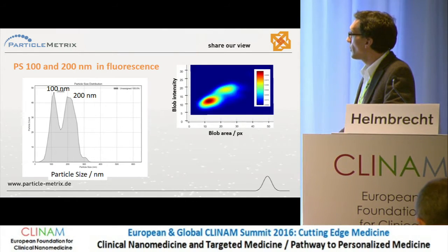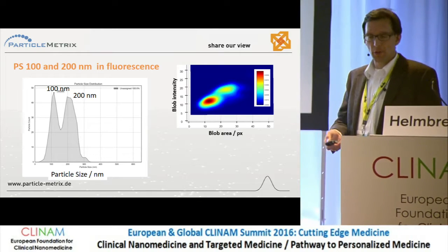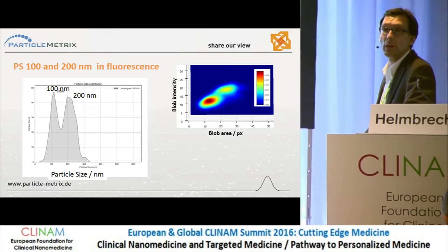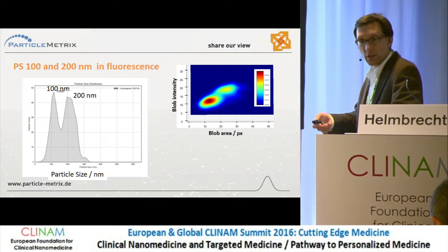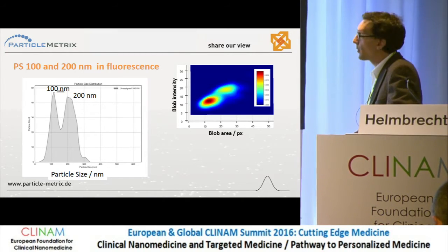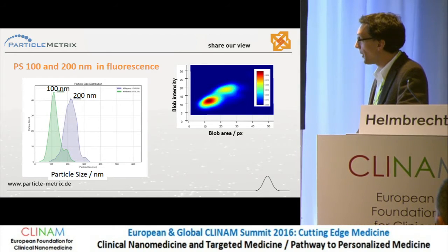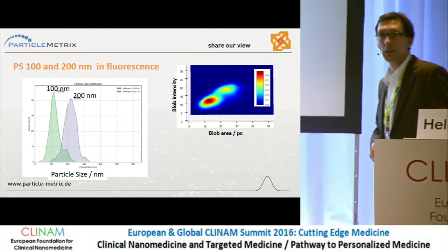In order to increase this, we can also make use of multidimensional and multivariate statistics, not only taking into account the step, the jump of the particles, so the diffusion behavior, but also the size, so how large is the object, and physical parameters of the object, so we can do multivariate statistics in order to separate. So this was quite straightforward, because it's two different sizes, so this is not so difficult to do, but just to give you an idea of what you can do.